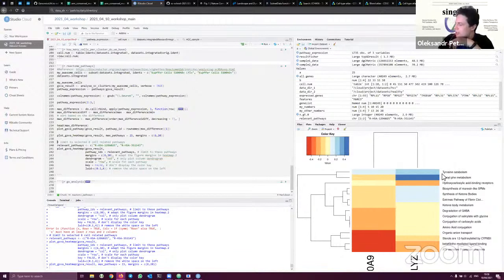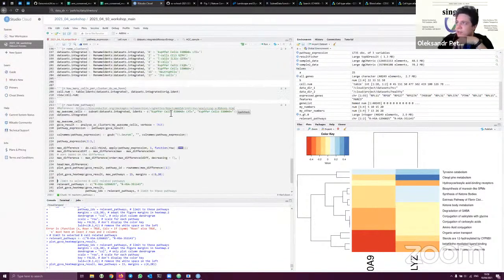Of course, it's not a great example, again, because we selected quite a few cells for this analysis, and usually you select a few thousand cells, or maybe tens of thousands of cells, and there it looks much more interesting. And even when you finish the workshop, you can just compare all the cells we detected and see how it's different. So just for fun, we can actually compare Kupffer cells with non-Kupffer cells.